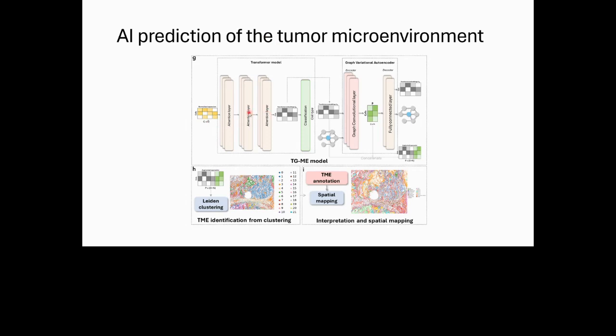Okay, yes. So as Dr. Flores explained to you, we're going to be using deep learning to identify the different niches. So we're going to start with our normalized matrix. The first thing that we're going to do is to pass it through a transformer model. I'm going to explain more details in a bit. This transformer model is going to have 3 attention layers, and it's going to be trained to classify the different cell types. But what we care about is the embeddings that the transformer generates, which have what we call the attention scores, which is going to tell us the interaction between the genes.